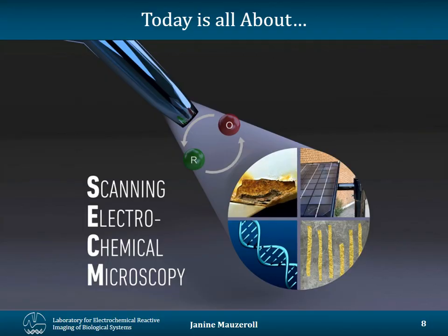So today is all about scanning electrochemical microscopy. And we see on the left-hand side in blue a micropipette tip who's basically playing ping pong with a surface using a redox probe highlighted in red and green. And so this redox probe in scanning electrochemical microscopy gets oxidized or reduced at the surface and then diffuses back to the microelectrode, where it will exchange electrons and generate a current, which we will be monitoring.